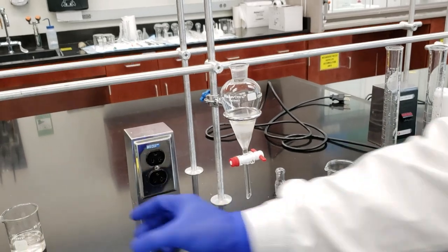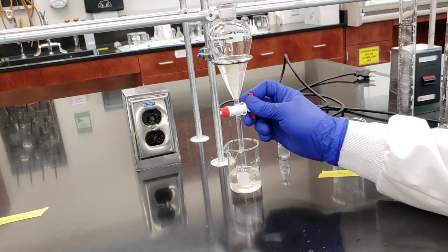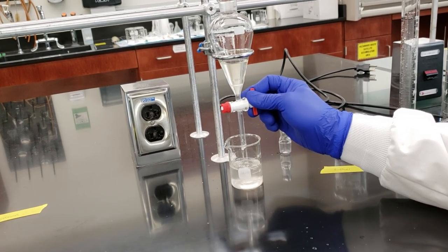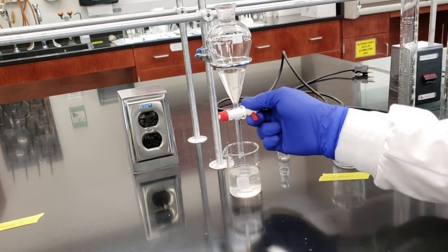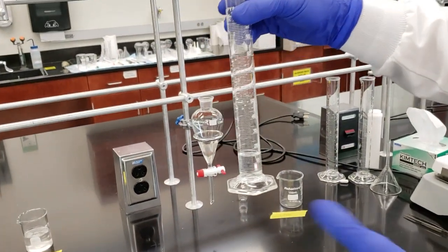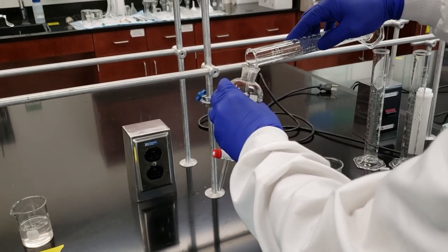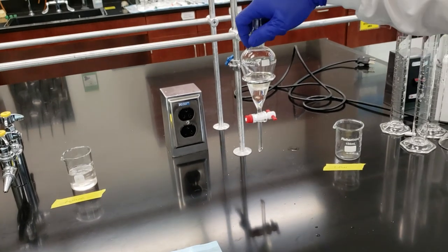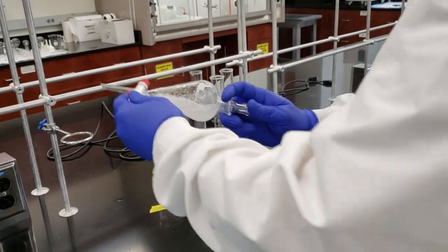Take our stopper out. Bring our aqueous catch flask or catch beaker back over. Drain off our lower layer. Again, our aqueous layer has been drained off. One final 15 mil portion of our 5% potassium hydroxide. Pour that in. Stopper in place. And we'll do our last wash.